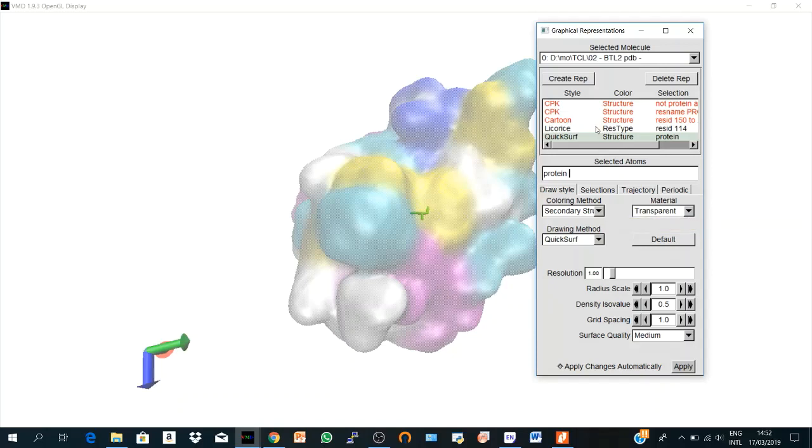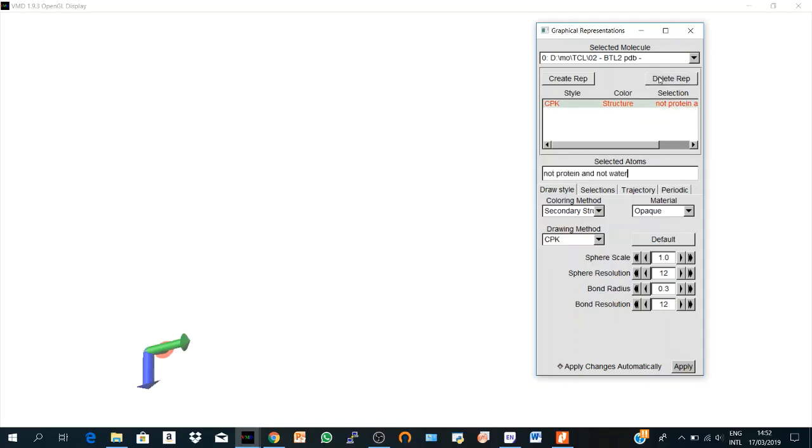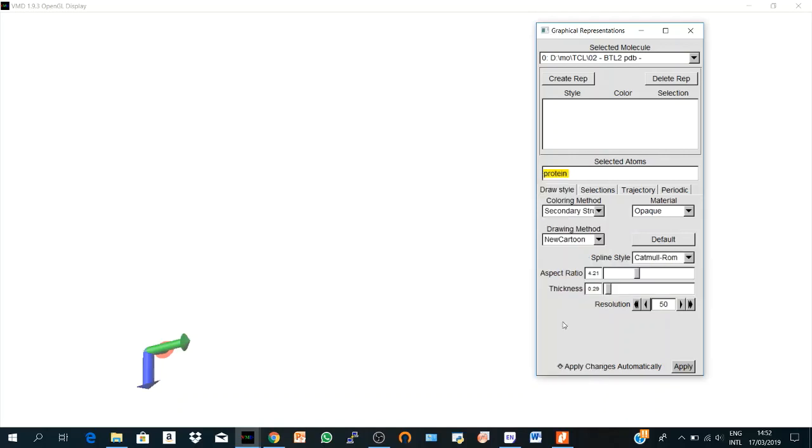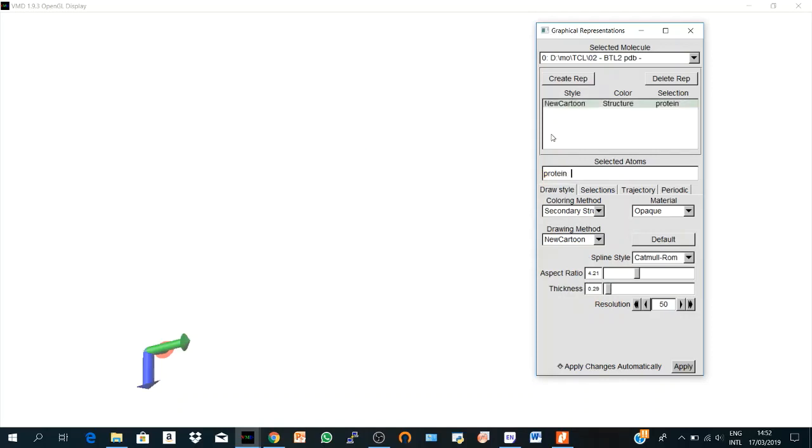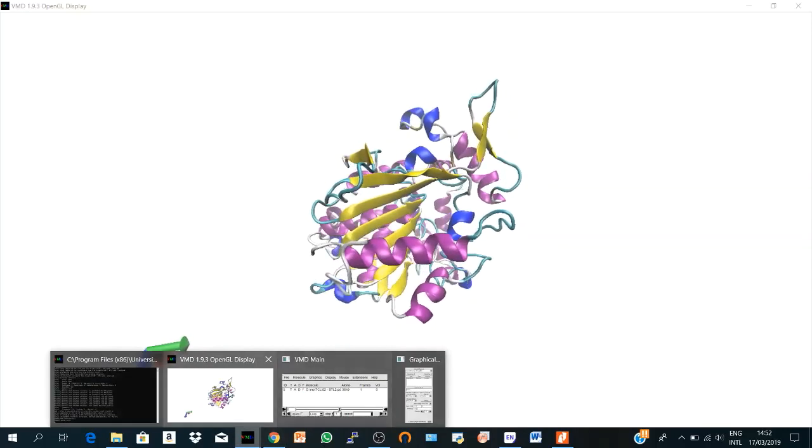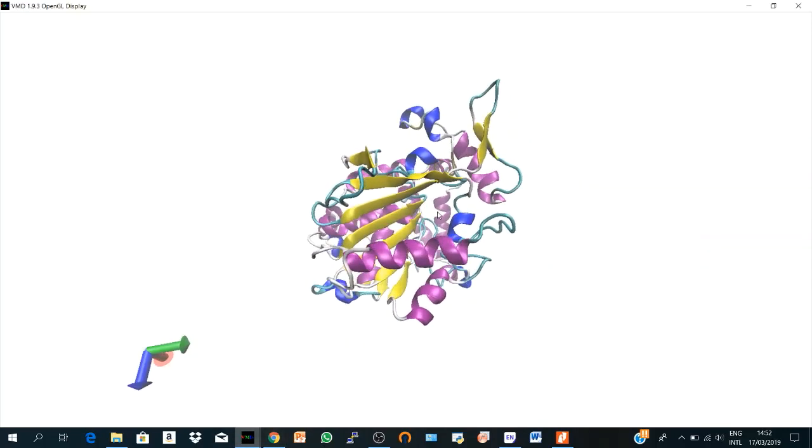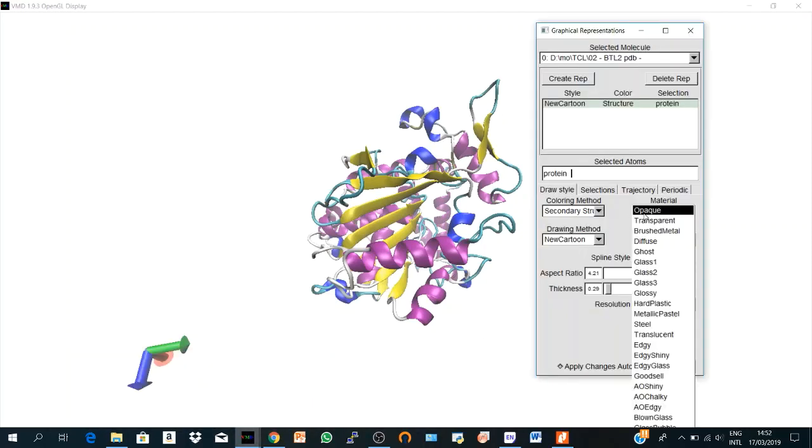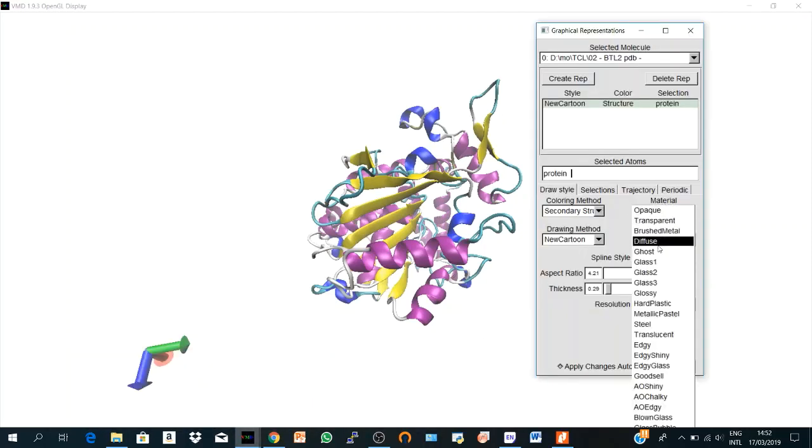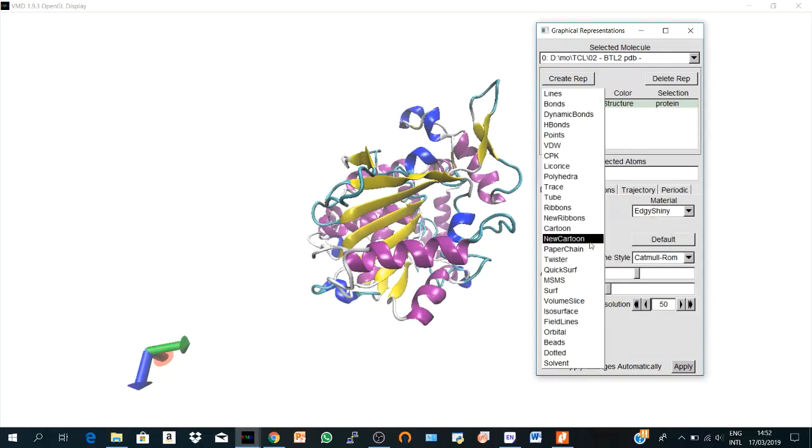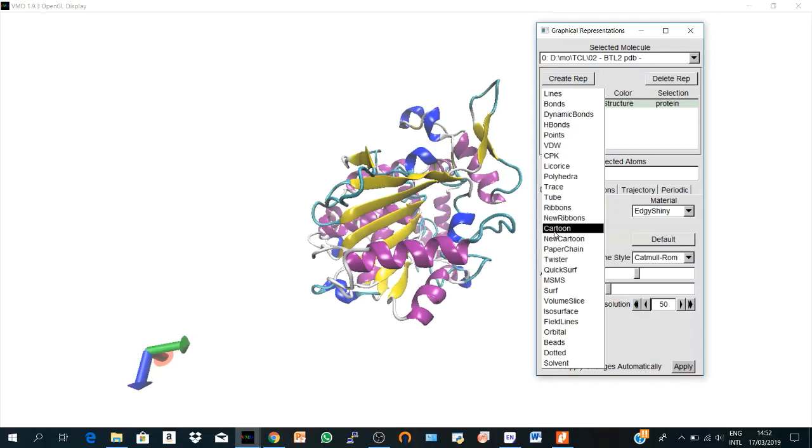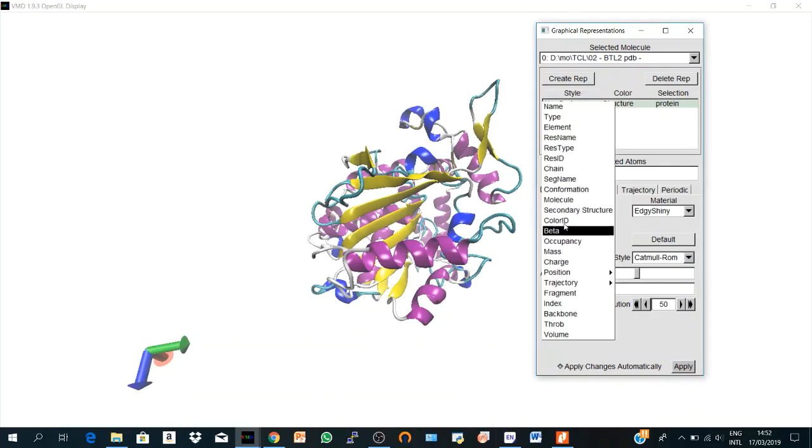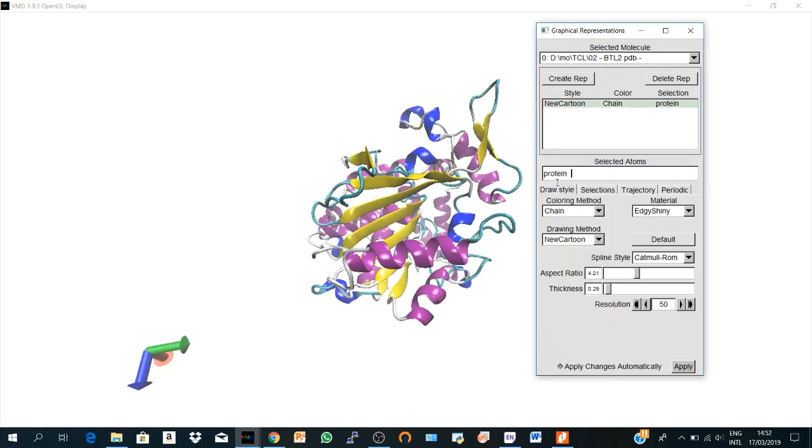So let's get rid of all these representations. Delete, delete, delete. And say protein, only protein. And New Cartoon. Sorry, I hit it. Create representation. And let's change the material. I like Edgy Shiny. Let's make it chain. We are going to get a very nice figure here. Let's say New Cartoon and where is chain? Yes.